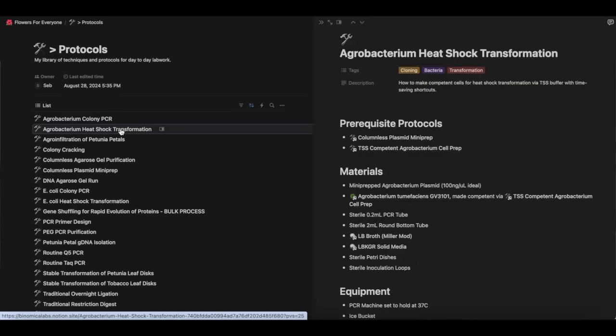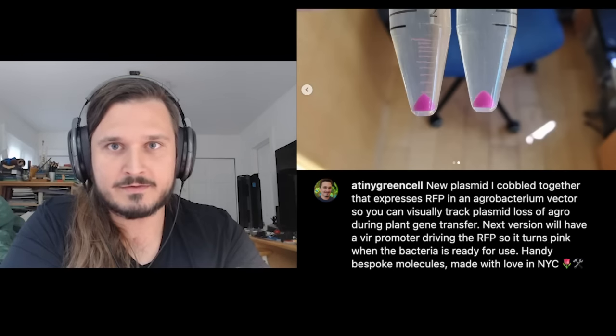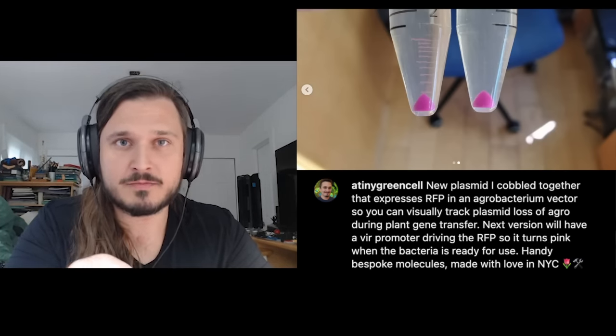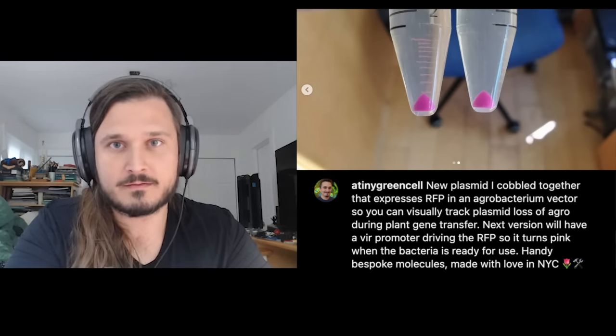Because of the mechanisms inside that plasmid, it'll also give the Agrobacterium the ability to survive on media with specific antibiotics. And so you plate the agro on media with antibiotics. On top of the antibiotic gene, I like adding a visual marker. So all my Agrobacterium, when they're armed, turn really, really bright pink. And so I can just look at a plate of white colonies and pink colonies and say, okay, those have my plasmid.